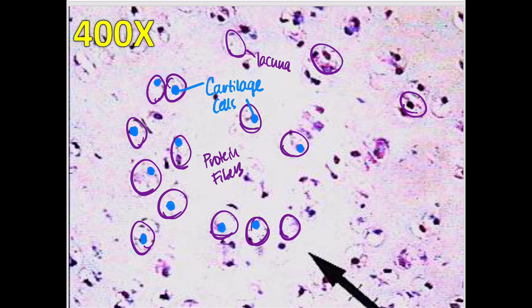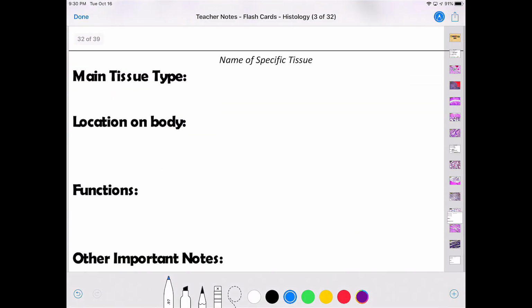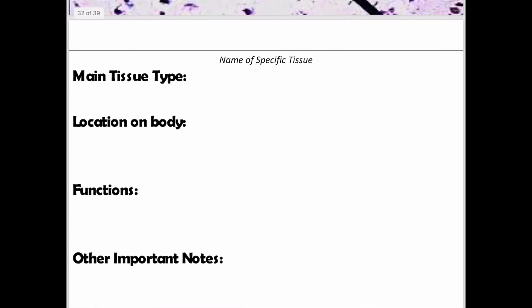It is hard to remember, again, kind of more like plastic though, right? If you think about the difference between plastic versus rock, plastic is just a little bit more flexible, and the same is true for hyaline cartilage. So if I scroll down here, I'm going to go to black. All right, so this is hyaline cartilage. I don't, unfortunately, have slides of the other types of cartilage, elastic or fibrocartilage, just hyaline.